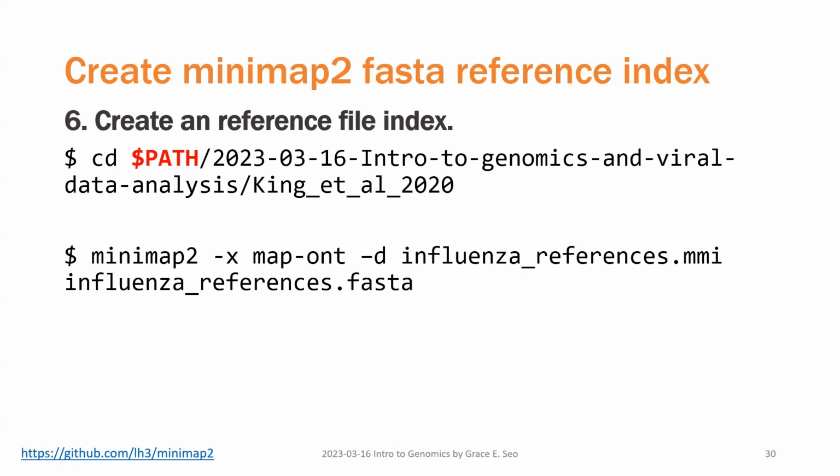Somebody was asking how long NanoPlot would take to process. It depends on your processing power. If you have about 16 gigs of RAM and an i7 core, it should run within a few minutes. But it also depends on how big your sample is, like your fastq. If it's a gigantic one, even on a cluster like a supercomputer, it could take up to a few hours. For this one, it shouldn't take that long because the fastq file is small. It should take a few minutes, or at most 10+ minutes.